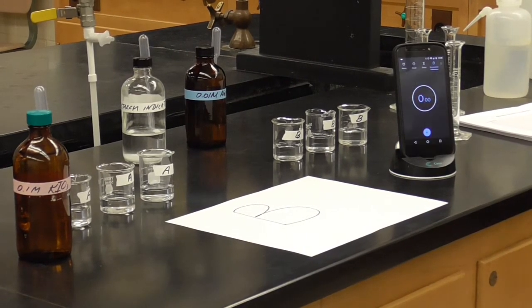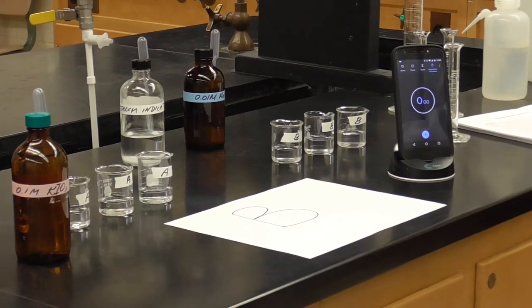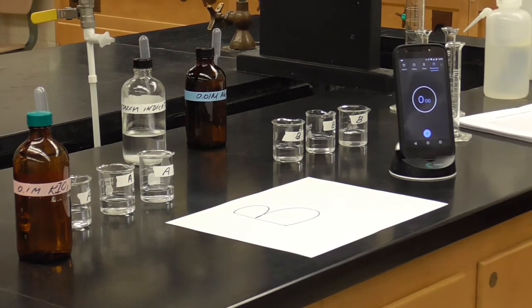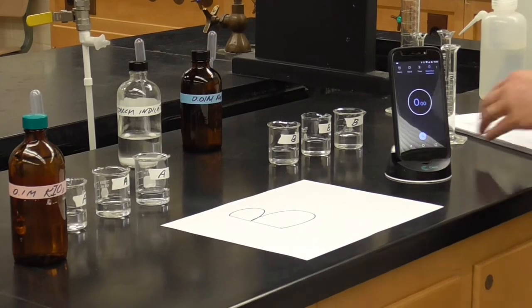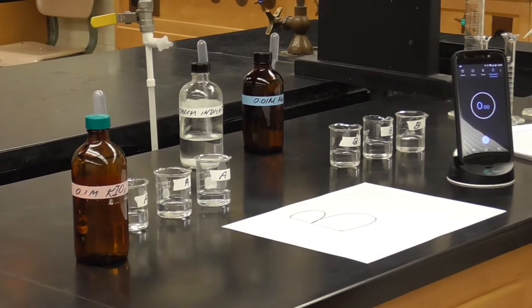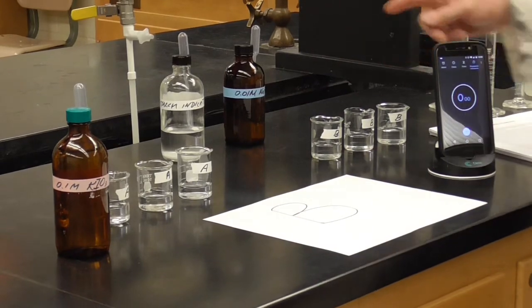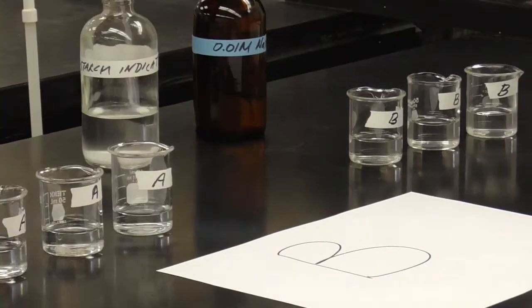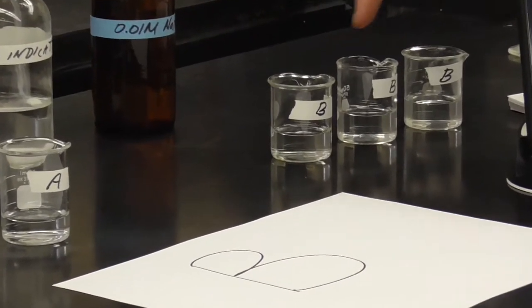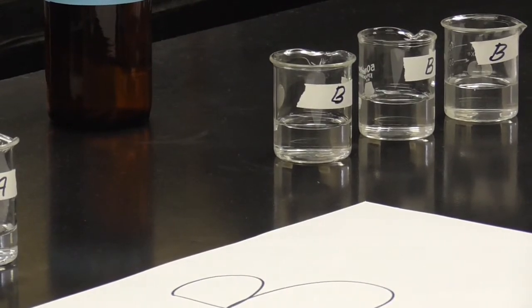And so it's kind of fun. You sit there and you watch it, and you just wait and wait, and all of a sudden, boom, it changes color. Now, what determines how long it takes to change color? The concentration. And we have beaker A over here, 3 of them, and beaker B, 3 of them. In beaker B, we have the reactant, which is sodium hydrogen sulfite, the indicator, and water. Now, I've already mixed these together. They're 3 identical beakers, just to save us some time on the video, so they're ready to go.